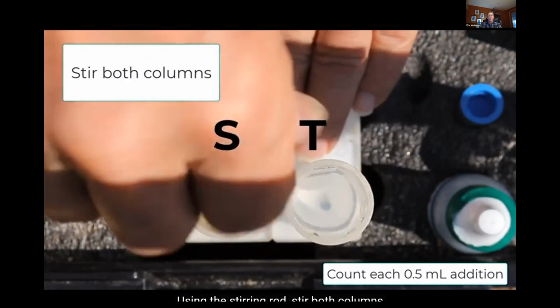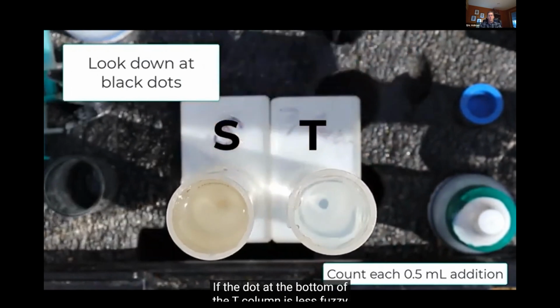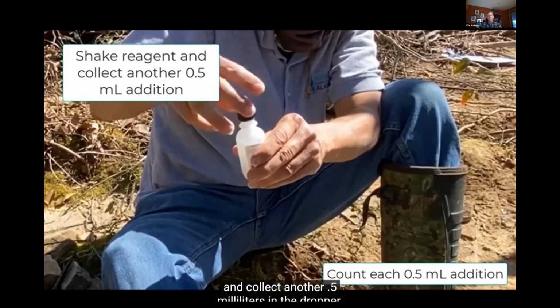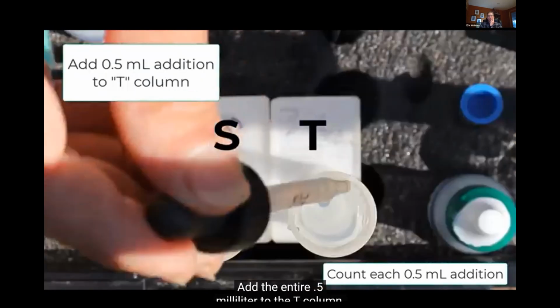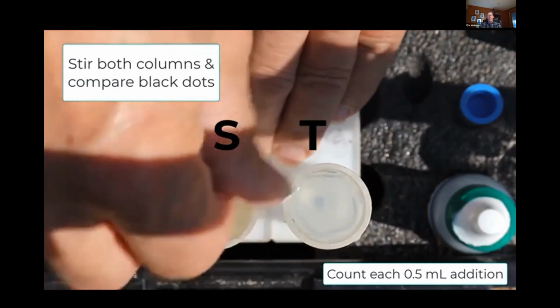Using the stirring rod, stir both columns, then look at the dots again. If the dot at the bottom of the T column is less fuzzy than the dot at the bottom of the S column, shake the standard turbidity reagent and collect another 0.5 milliliters in the dropper. Add the entire 0.5 milliliter to the T column. Stir both columns and observe the black dots.